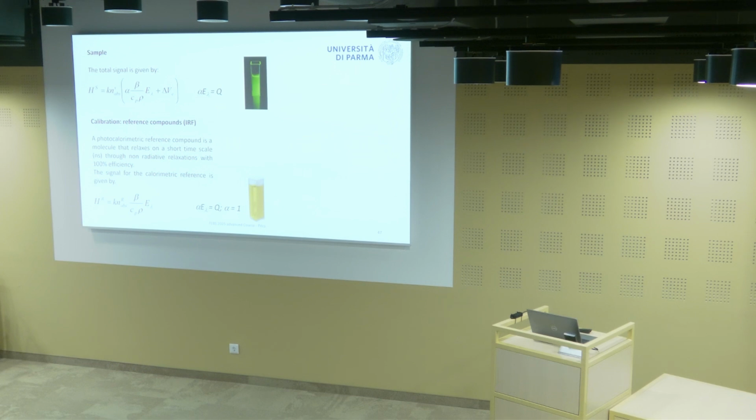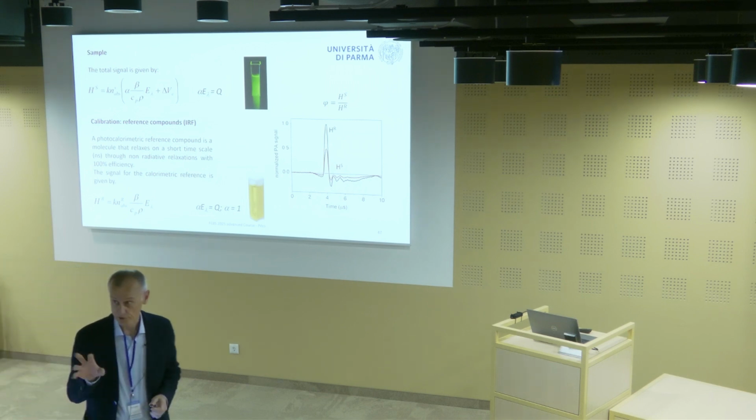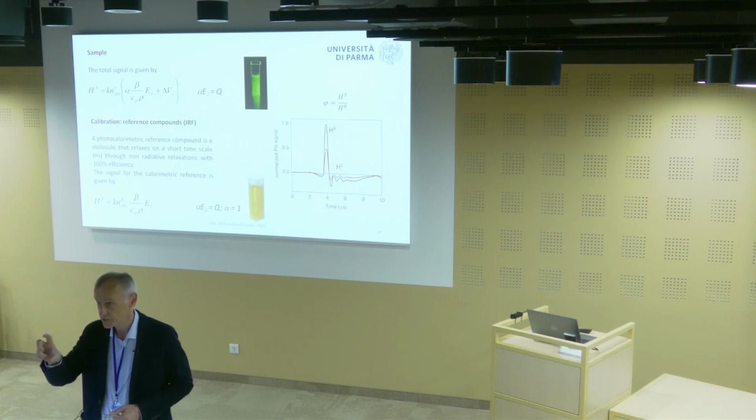Okay, so that's the equation, no volume change. That's our calibration signal. How do the signals look like? That's the way they look like. This is your calibration curve. That corresponds to the response of your detection system when you have full release of absorbed energy as heat.